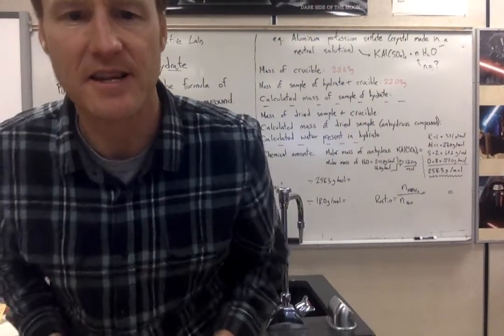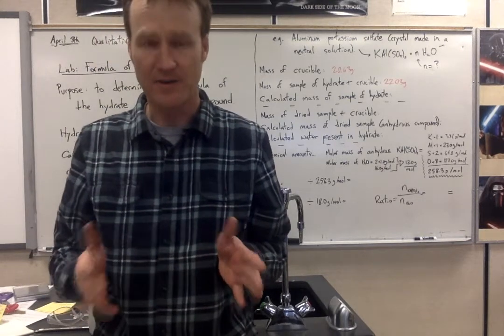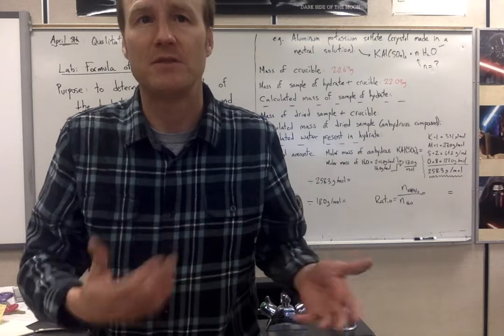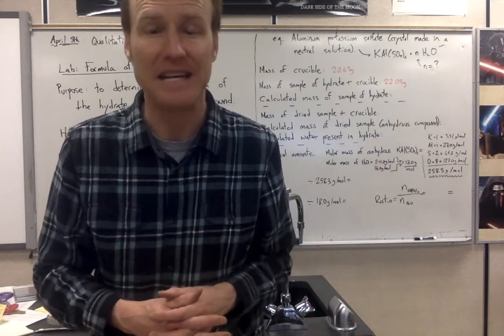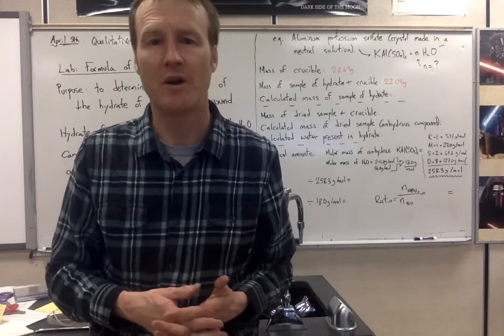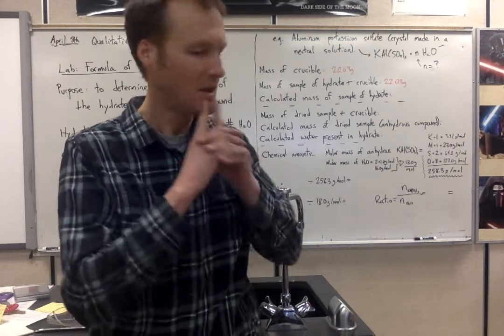a decomposition reaction. A decomposition reaction, Science 10, you are taking a chemical compound, single chemical compound, and you are maybe subjecting it to some kind of stress, maybe heating it up, and the chemical compound breaks down into more than one compound or maybe more than one element, depending on what your reaction is.